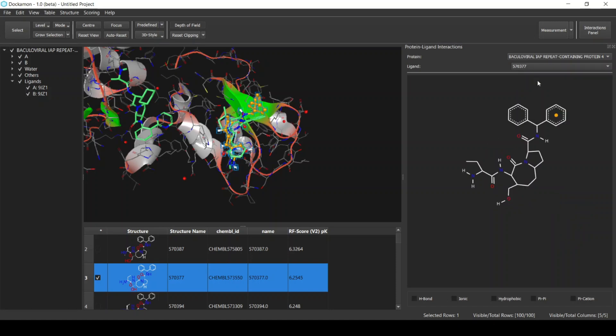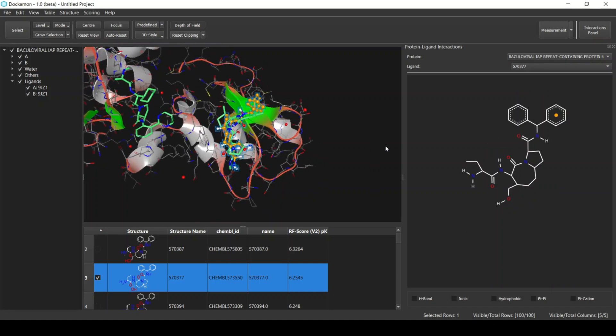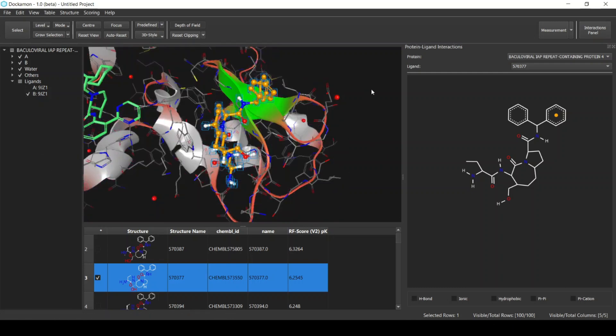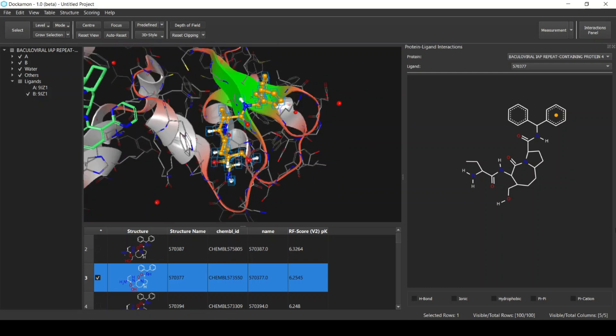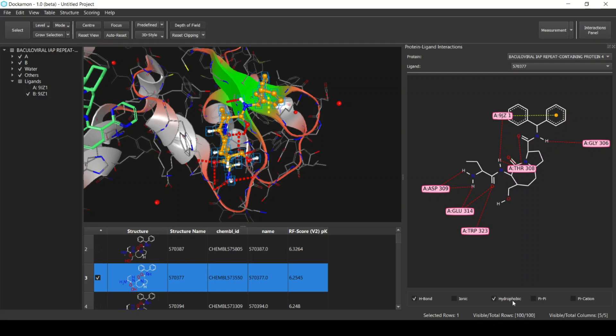For example, the current ligand—first of all I will hide the native ligand. You can select which interactions that you want to display, for example hydrogen bonding and hydrophobic interactions. You can also customize the rules for the interactions or how the interactions are displayed.